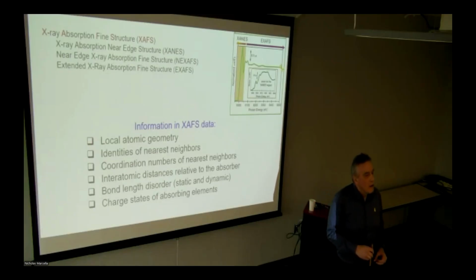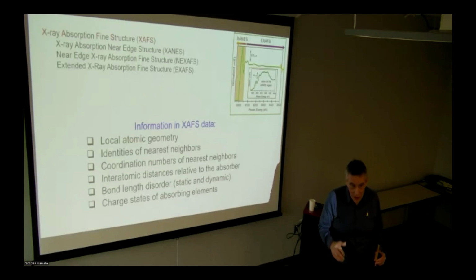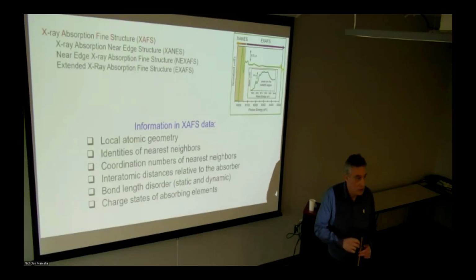So again, the question is, if my absorbing atom has 2 metal atoms, or it doesn't matter, metal or not, or 3 or 4 atoms of the same type, 3 different models are considered. Why would I get the answer from this experiment? How would I know based on the experiment that it's 2, 3, or 4? And why? What do you think?